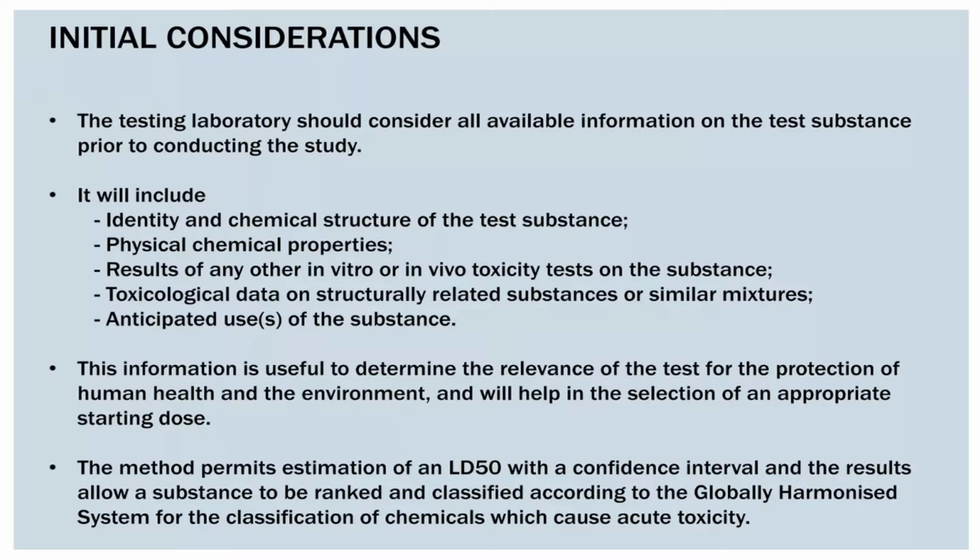If you have previous toxicological study data or any documents that show the substance's character, you can easily decide what dose to choose to start our experiment. Suppose your product's LD50 is around 200, then it is more convenient to use 175 mg as the starting dose.